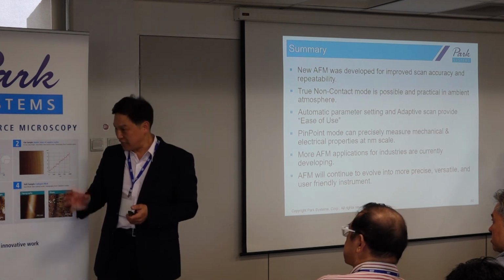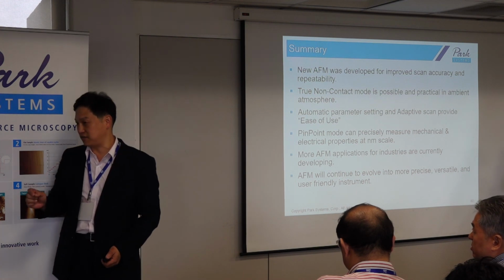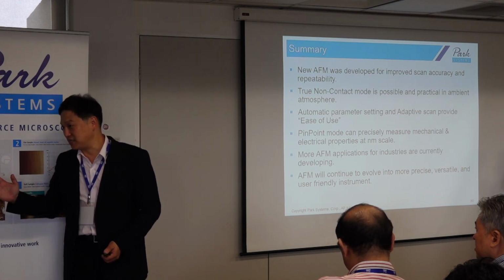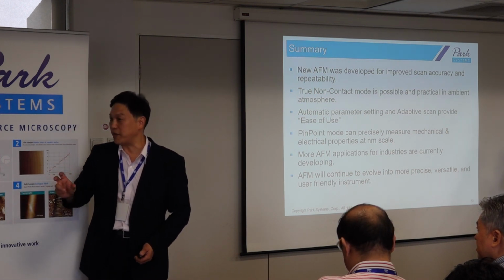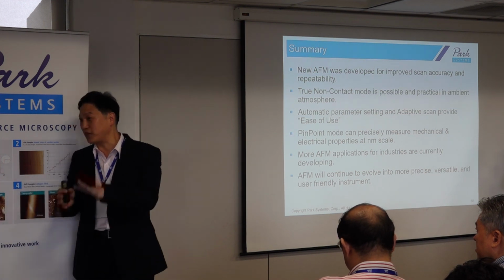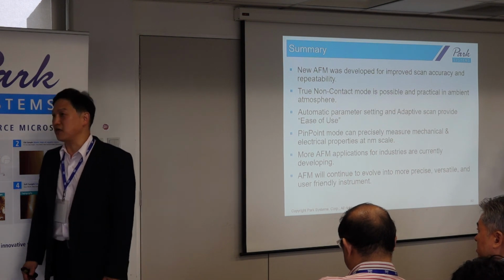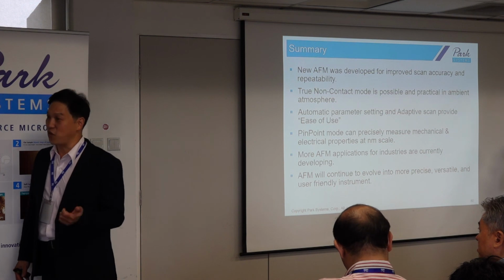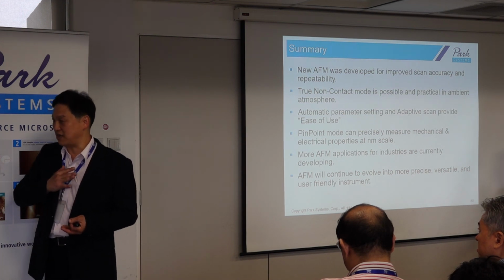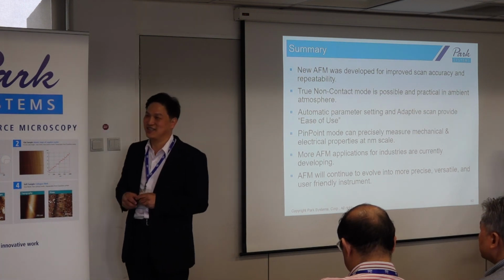Is it controlled by the software? Yeah, everything is controlled by software. Right now we want to detect the current on this spot, and in normal scanning mode, we just pass by in 0.1 seconds. But in order to optimize the signal to noise ratio, we need to stay there 0.5 seconds. That way we can optimize the signal to noise ratio and get the best result. So it takes more time compared to normal contact mode. But if you see the demo, it's not that slow. It's almost like a slow scanning mode, but it minimizes the scanning artifacts as well as other things. So you should try to see.